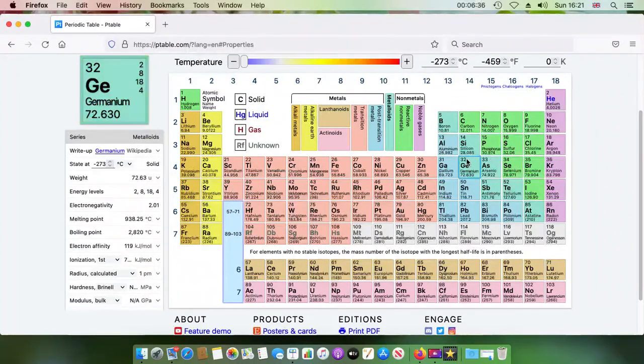And so you can see from this which element that was that we had the drawing of. If you look at a mass spectrum of that element, that is what a mass spectrometer is all about, showing the mass of these things.